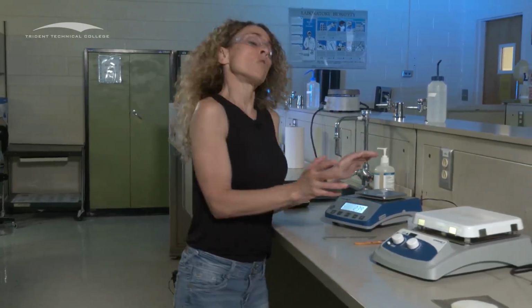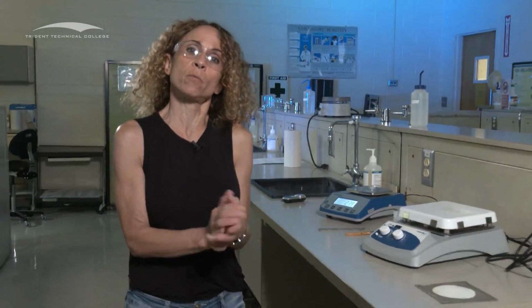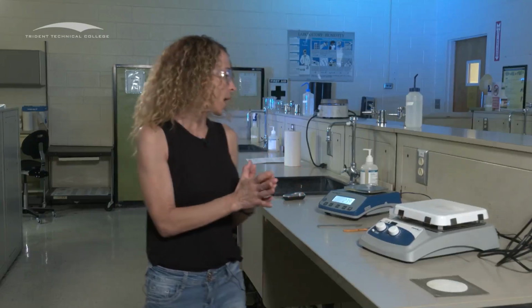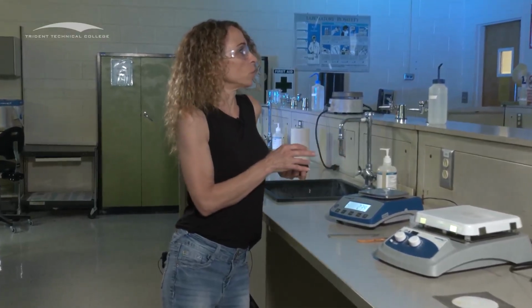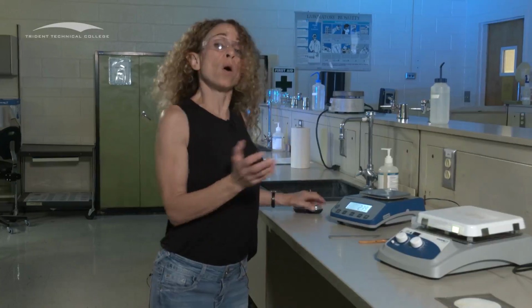Now, what I wanted to show here also is that when you're going through both of these procedures, you're going to come to a point where you're going to have to be doing heating to a constant mass. Okay, so heating to a constant mass, what does that mean? All right, we use this technique for 2 different reasons. One reason is to dry off a product, get all of the water off of a product, which is why you're doing it in the alum lab.